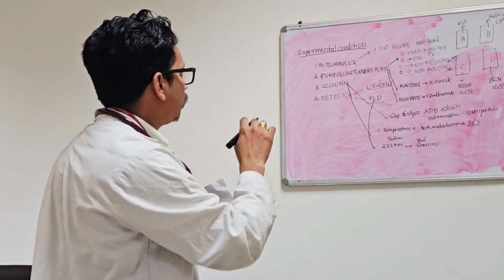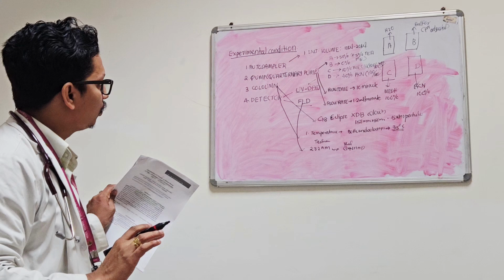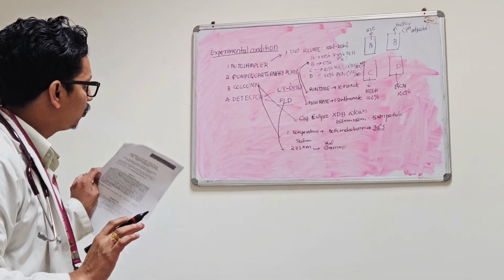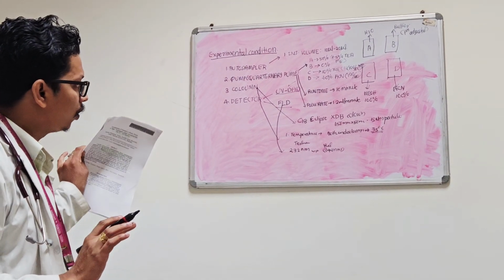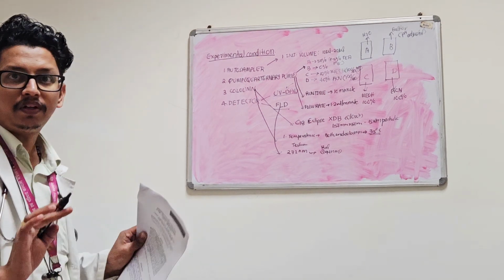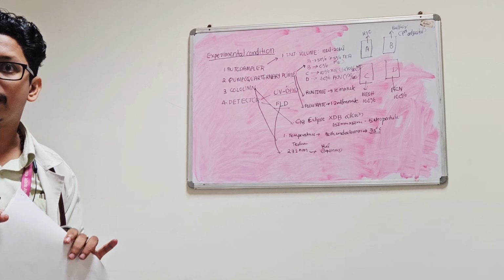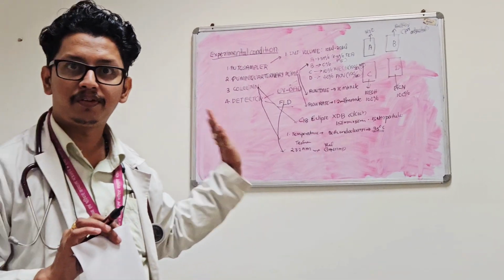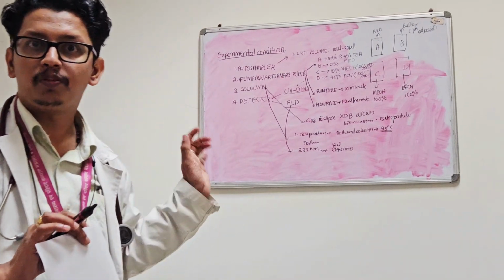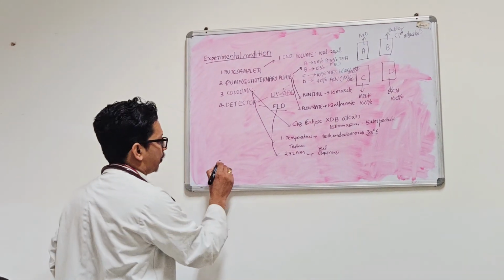So what are the parameters we set? Auto sampler injection volume set, quaternary pump gradient set, run time set, flow rate set, then column select, column temperature set, and detector select, detector wavelength select. These are the experimental conditions we need to configure and save as a method in a file and folder. Then we select this method and run using the single run command.